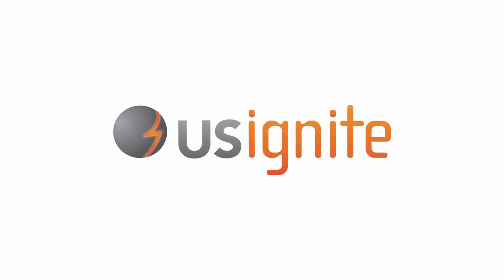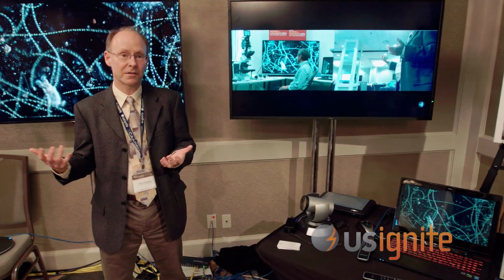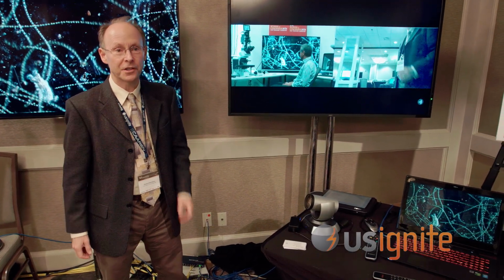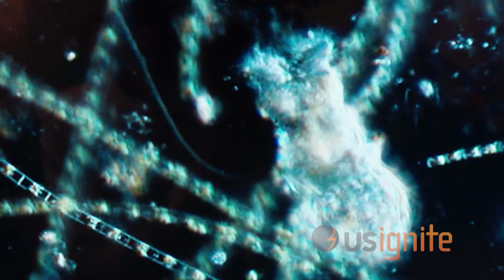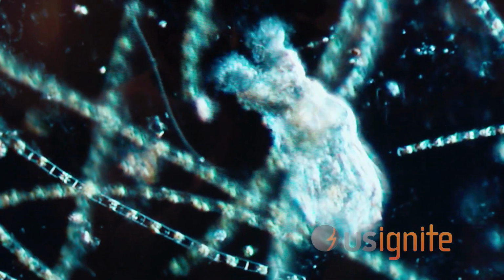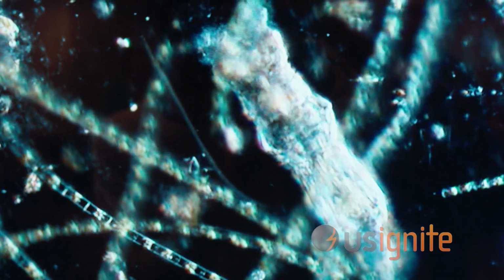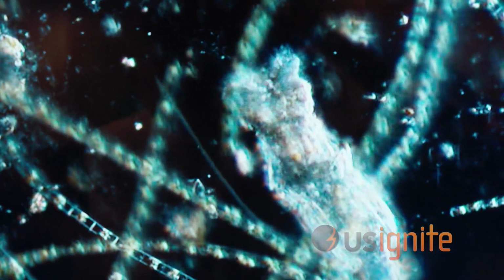Well, I'm Richard Weinberg from the USC School of Cinematic Arts, and we've set up a project that is telemicroscopy for teaching biology. And what we're doing is really opening up the micro world of microorganisms and other microscopic phenomena too small to be seen with the naked eye, bringing this into a STEM high school class.